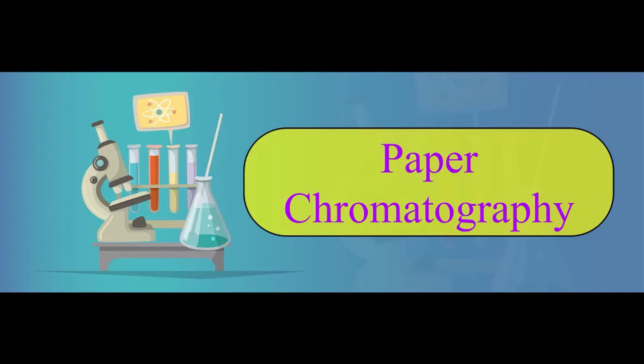The chromatography technique that uses paper sheets or strips as the adsorbent, being the stationary phase through which a solution is made to pass, is called paper chromatography. In this experiment, we attempt to separate the different inks in the different color markers by using paper chromatography.